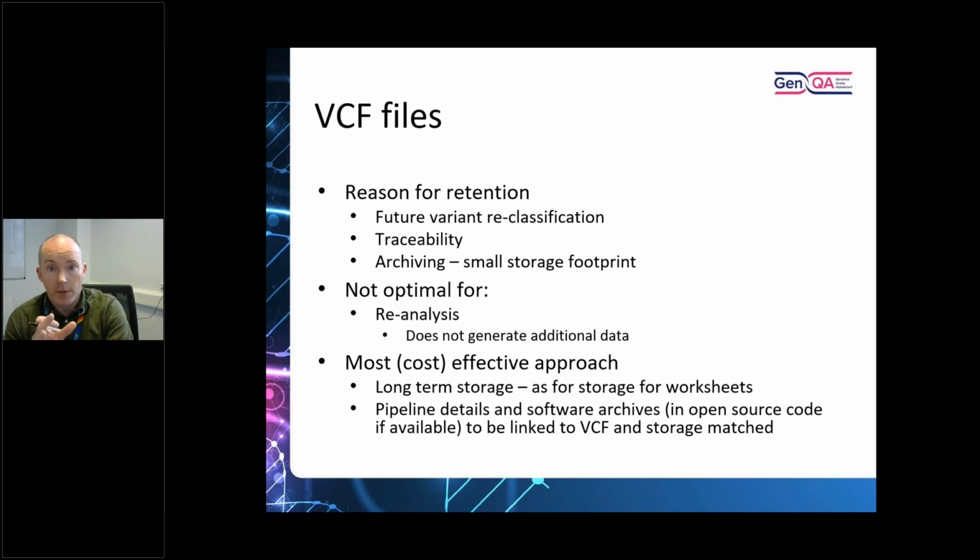So if you have a new pipeline or a brand new tool that's really shiny and will pick up on low-level variants that your other one didn't, it's probably not going to be the most useful. You're going to need the raw data for that, but it's arguably the case that you're not going to have a lot of situations where that would apply.